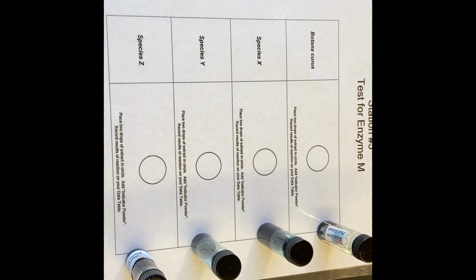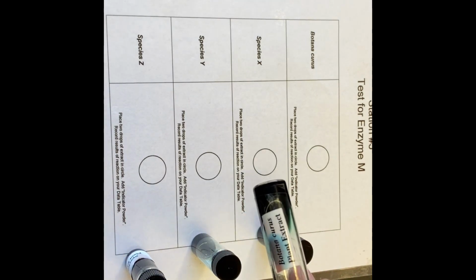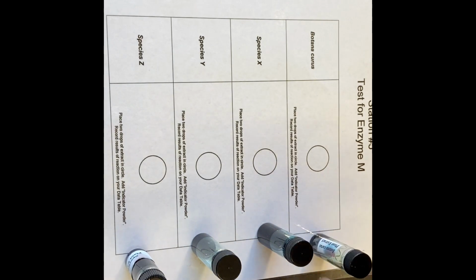Now we're going to begin station number 5, or test number 5, test for enzyme M. Each of these little vials has the extract in it. Botanicurus X, Y, and Z. And this one takes a little bit. It's more setup and actually not getting your hands all blue and green, affectionately known as teacher tattoos.